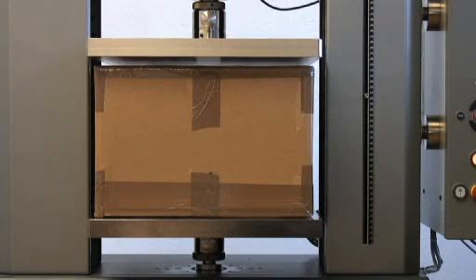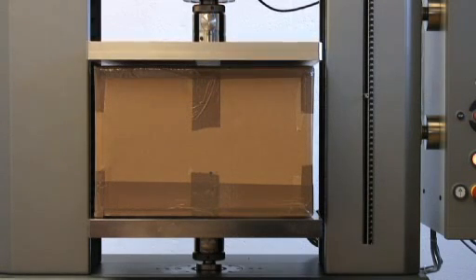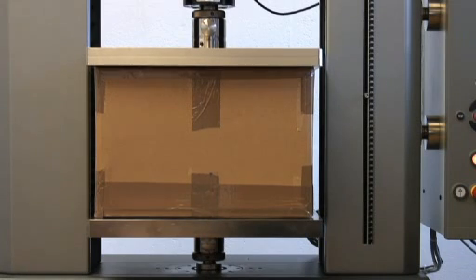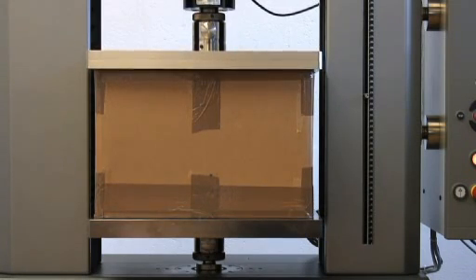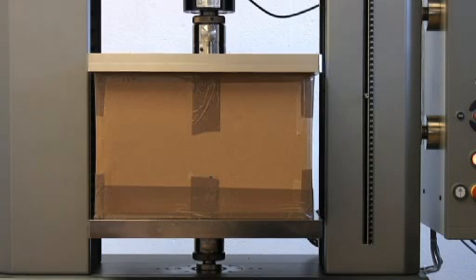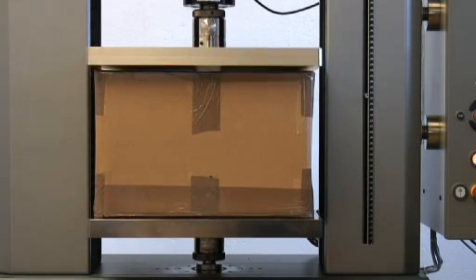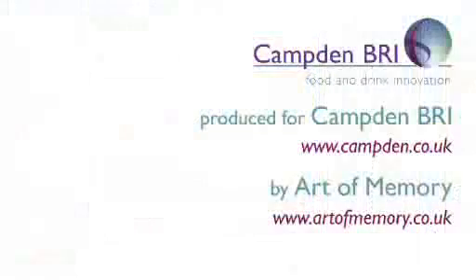The upper platen is lowered towards the lower platen to measure the force required to crush, in this case, a box. The force reading given to crush or deform a box can also be calculated back to understand the stacking factor, or the weight a container can withstand.